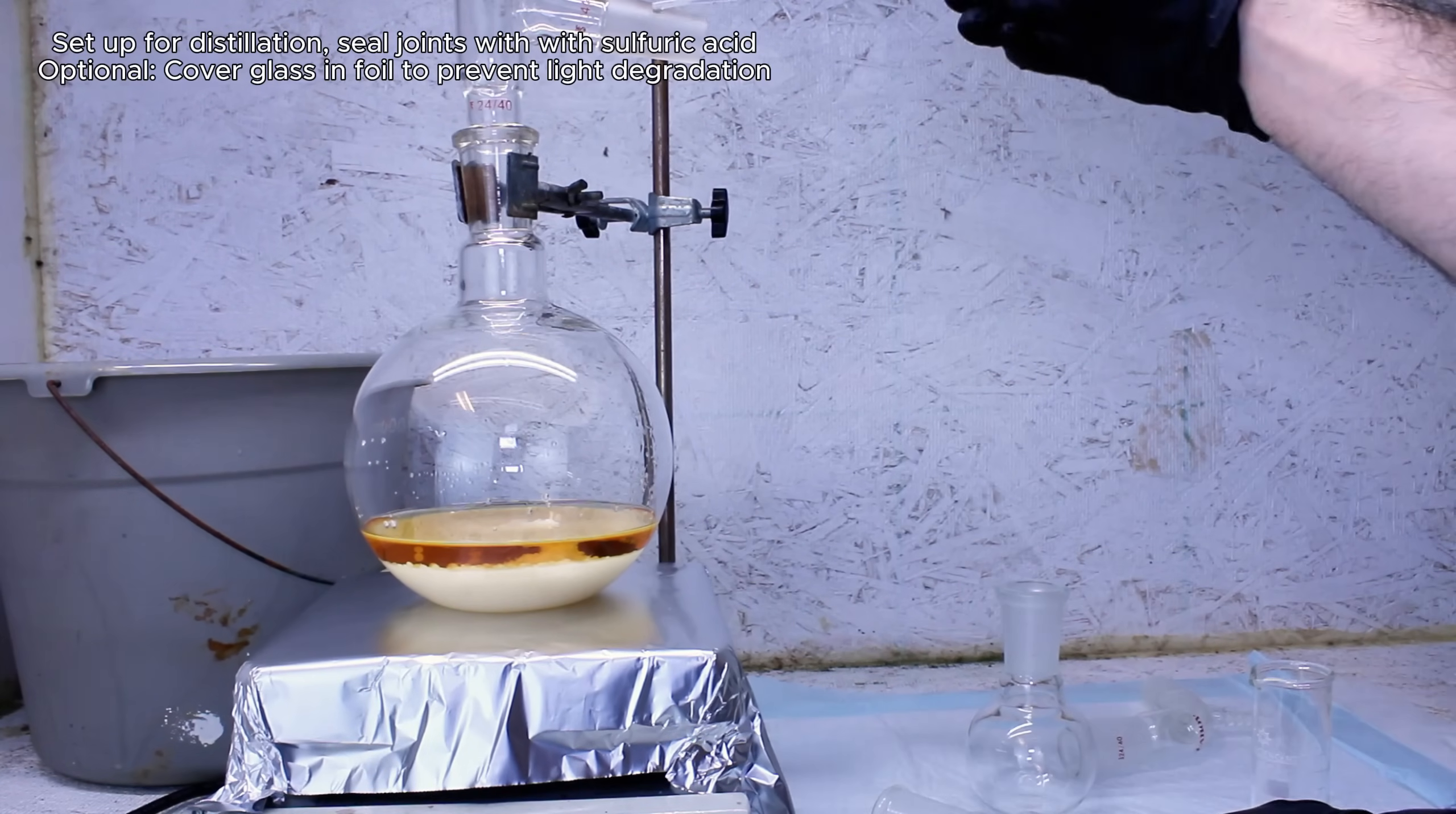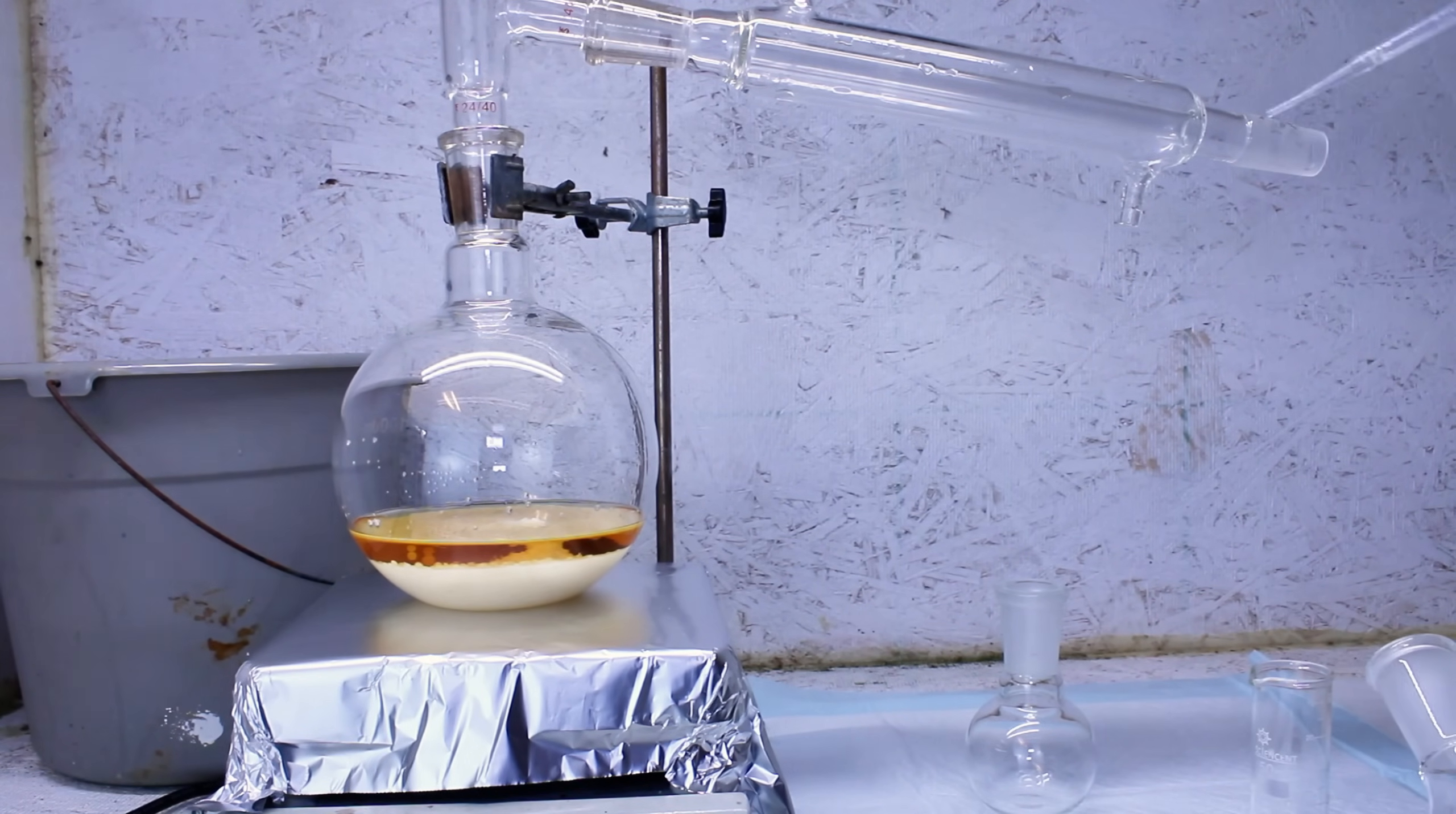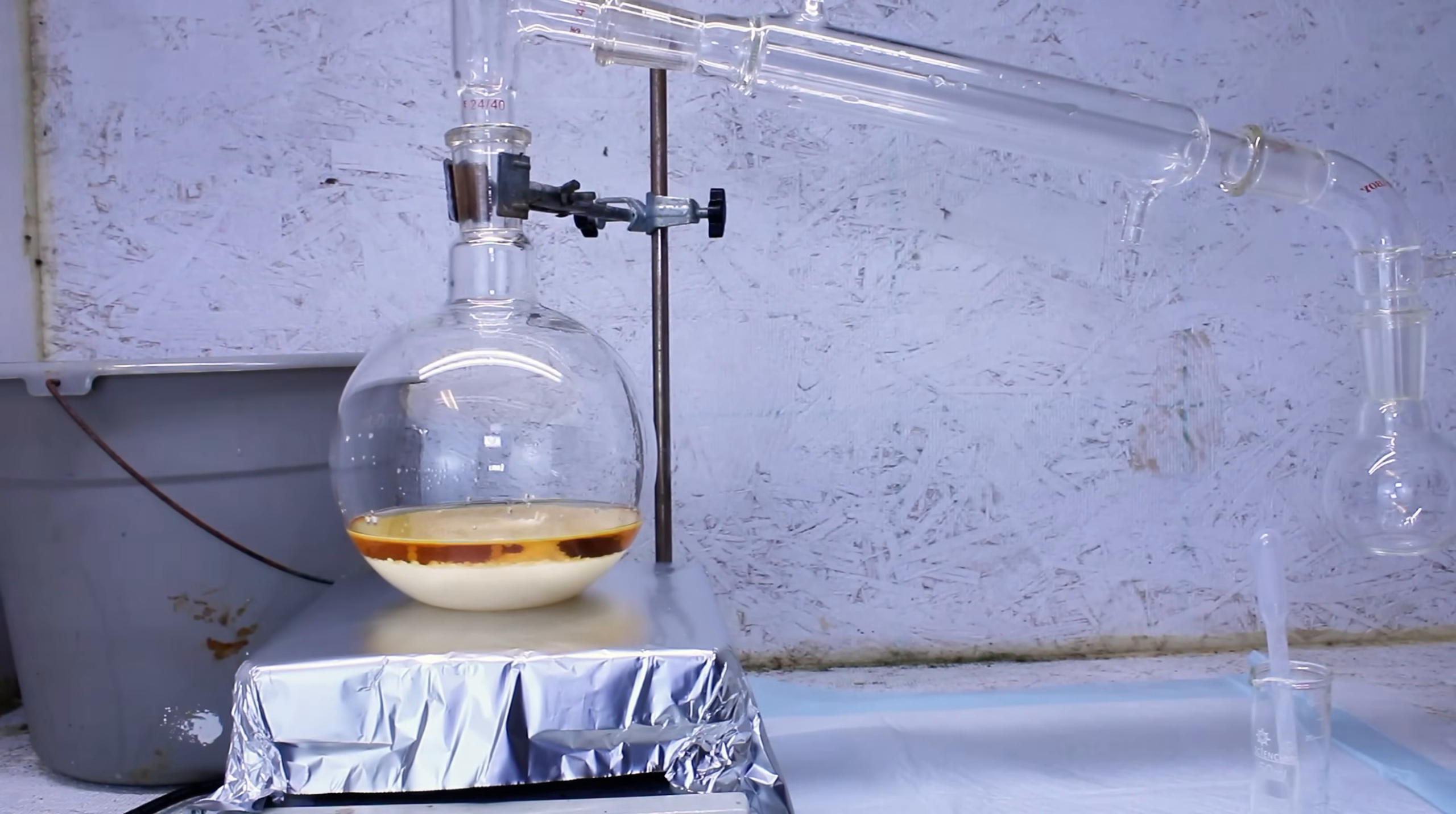This is then heated to begin the reaction, and as a side note, I almost always do this in a heating mantle, but for this video, I decided to do it on a hot plate to make the reaction easier to see. Now, when sodium nitrate is heated with sulfuric acid, two reactions are possible depending on the temperature the reaction is conducted at.